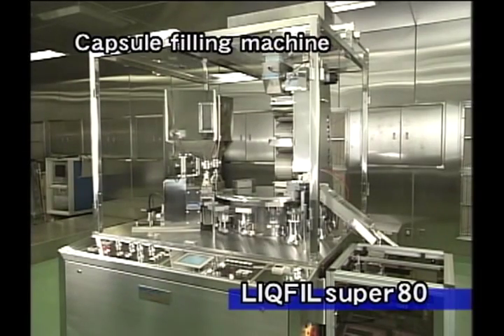This LiqFill Super 80 makes it possible to fill different forms of drug products, such as liquid, granules, tablets, or powder into capsules.